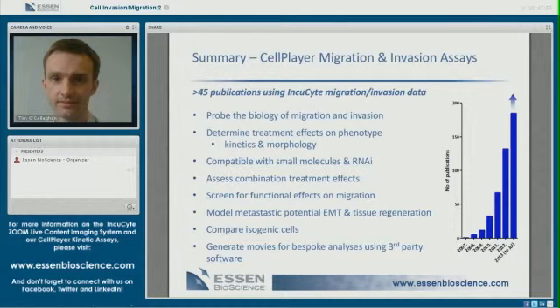So I'm now moving over to look at questions that have been asked during the course of the webinar, and I will just read them and answer them. Okay, so I've got a good question here. Are phenotypic measurements made in 2D space only? Can measurements of invasion be done in 3D? In other words, can you measure invasion in the Z-axis?